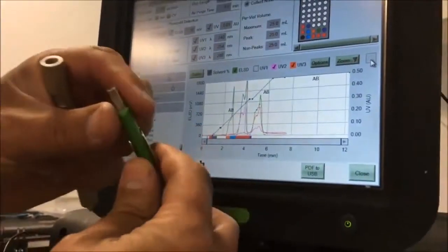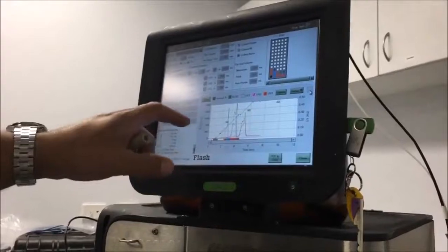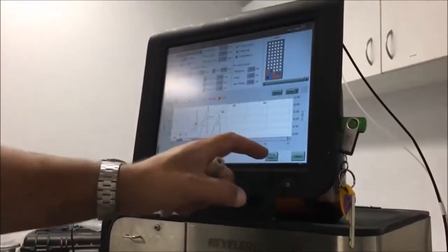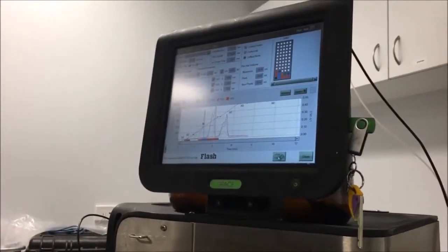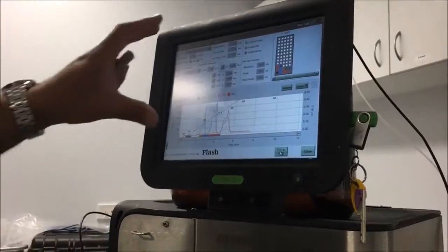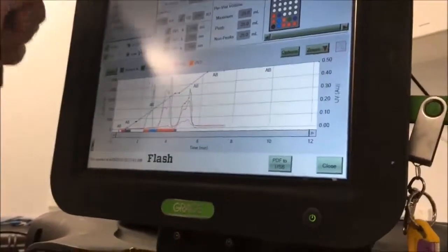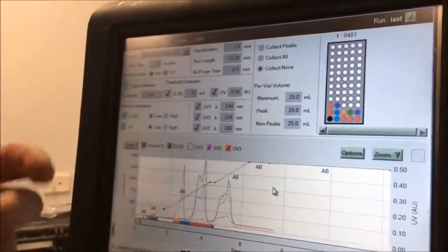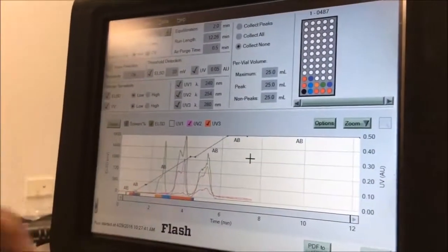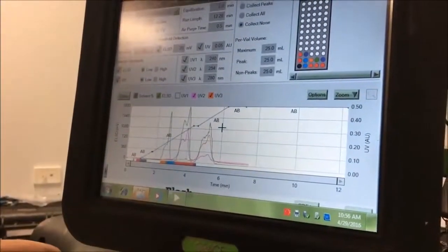Also, grab a USB stick on the side of the instrument, and to complete that run you can actually remove all that. It's the run PDF to USB, and it's saving. So you can save all the conditions on the USB, and it'll look like this. File, print, run reports. So I'll print it, I'll save it on the desktop to give you an idea of what the actual report will look like. So save, override the old one.